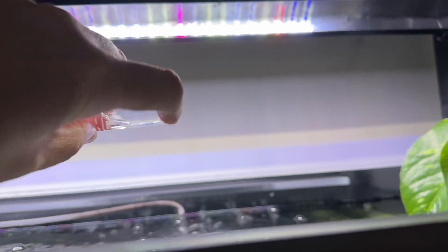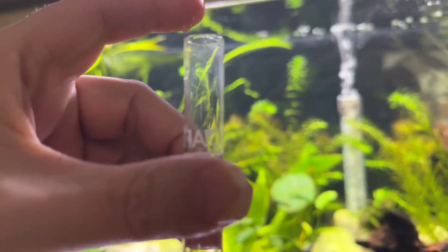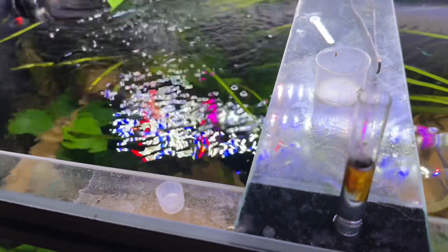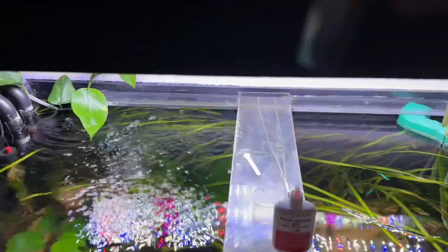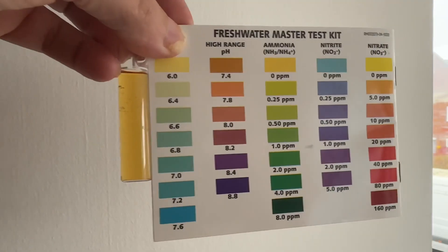By that standard, I should do a high range test just to make sure, to show you it's actually the cheap tester that's wrong. Five drops — one, two, three, four, five — put the lid on and shake. It hasn't even reached 7.4, so there was no need to do the high range one.